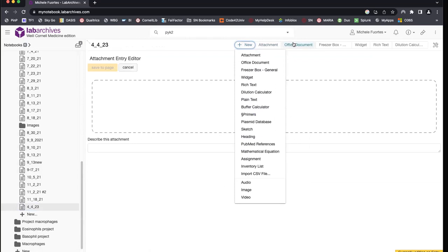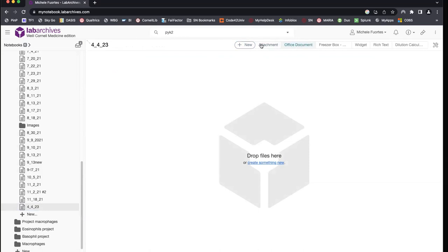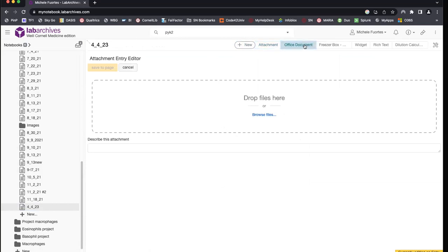Oops, sorry, no. Sorry. Here's my template.